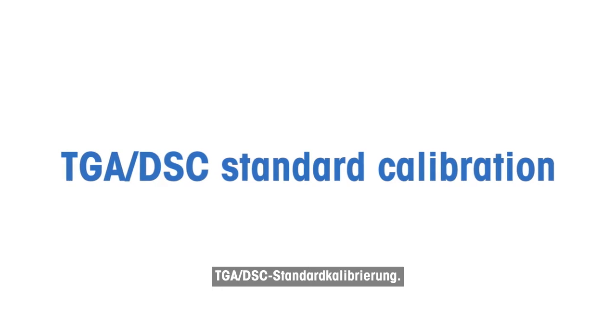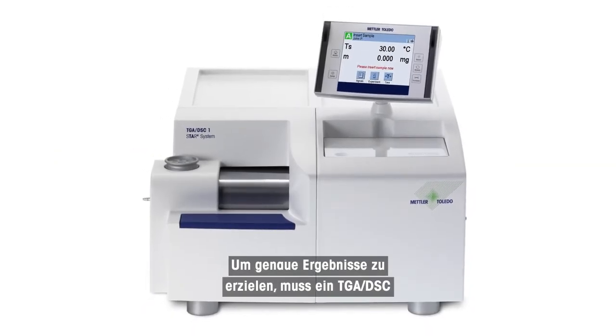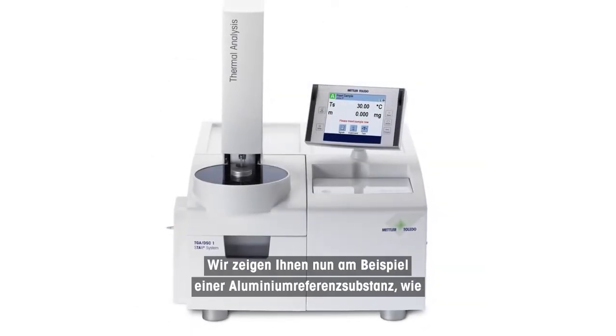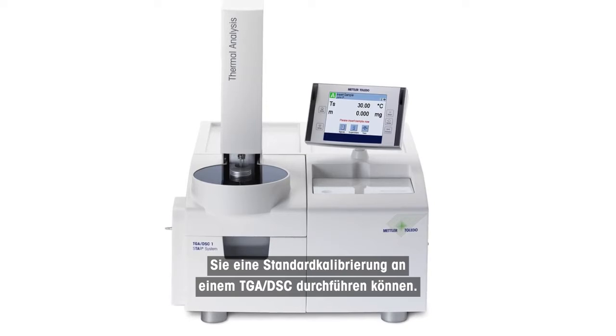TGA DSC Standard Calibration. In order to achieve accurate results, a TGA DSC has to be regularly calibrated and if necessary adjusted. We will now show you how to perform a standard calibration on a TGA DSC using aluminum reference substance as an example.